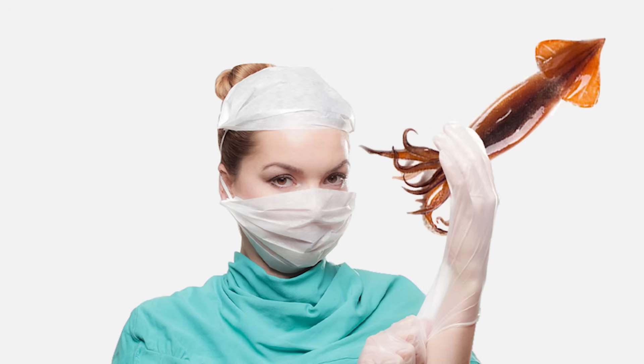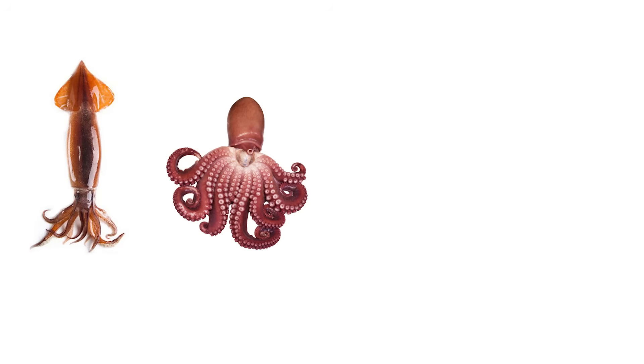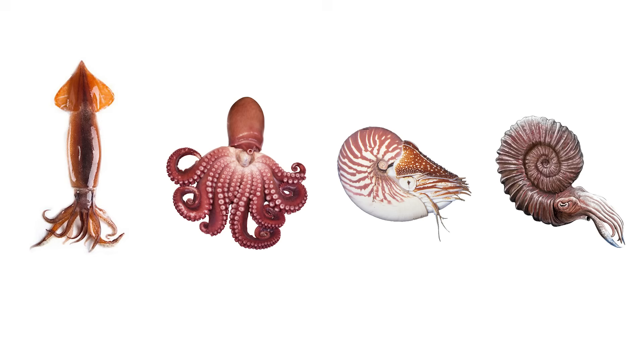Today, we're going to dissect a squid. Squid are mollusks and belong to a group called cephalopods. Cephalopods are animals with legs attached to their heads. This includes squids, octopuses, nautiluses, and extinct ammonites.